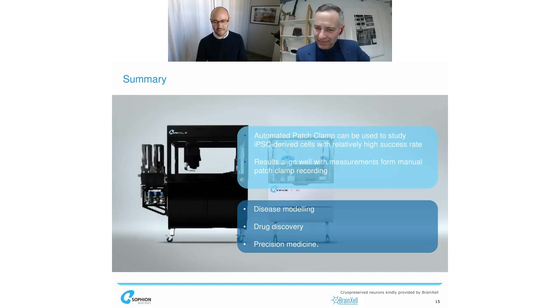Yeah, so the latest point that we have tested was 15 days in vitro. At that point, we haven't shown the micrographs for this, but there was clear network formation, and we were still able to get a single cell suspension. There was that missing plot that I unfortunately can't show, but I told you with words that we were still able in that scenario to get a 30% success rate. And just to remind you, with a 384 platform, that's still somewhere about 120, 130 cells to look at. So if that's the time point that you feel confident about, that this is how far you want to go, then I think that is still something that you could be doing with that technology.